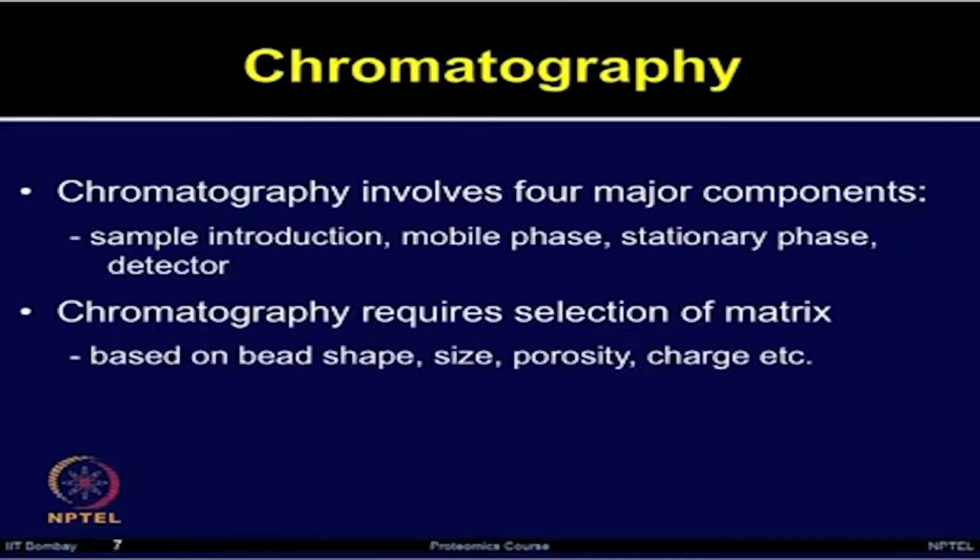The chromatographic technique involves four major components: an inlet for sample introduction, the mobile phase, stationary phase and a detector.